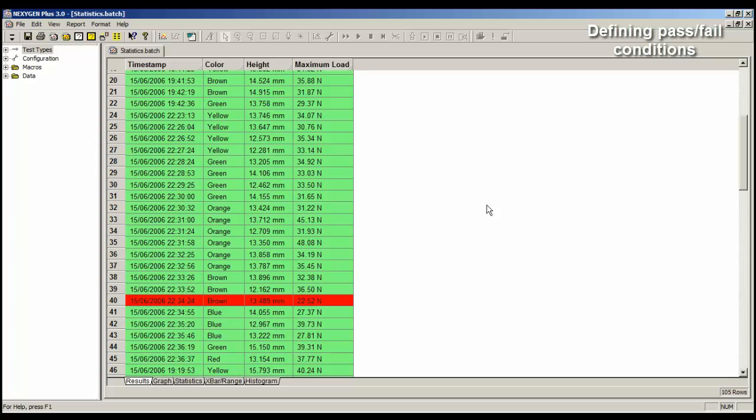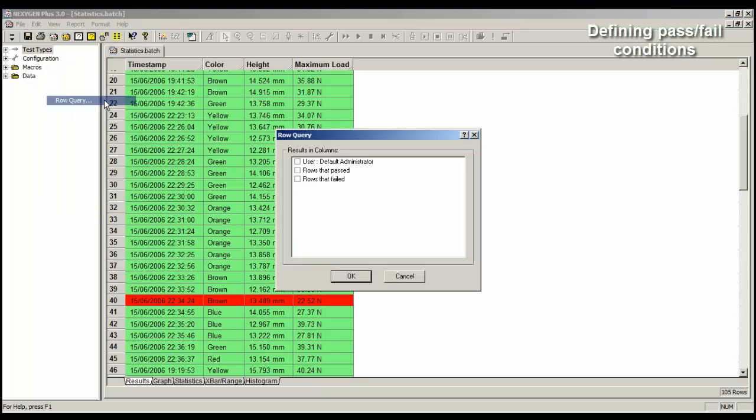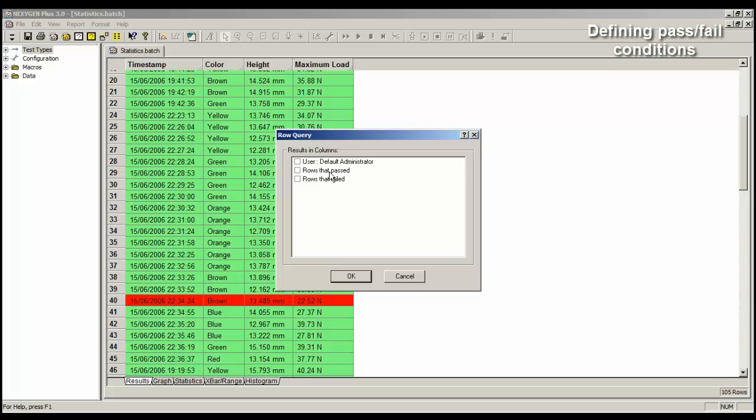So we'll select the main menu item of View. We call it RowQuery, but it is a filter. So we'll select RowQuery to display the dialog, and the options displayed in this dialog depend upon the batch file, but there will always be options of rows that passed and rows that failed. Select the rows that failed option, and then click on the OK button.